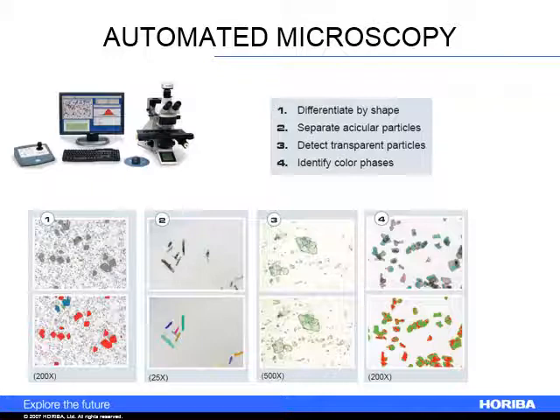Again, you prepare it on a slide, and now using computer control and thresholding, computer-controlled image processing, in conjunction probably with dyeing things and stuff like that. There are a lot of processes that can be involved here, but you save a lot of time because now it will take a picture and do the measurement. It will move over on the slide. It'll do another. So this is similar to doing it the other way, but now you've automated things to help you do some of the work.